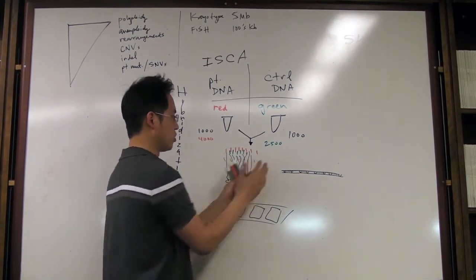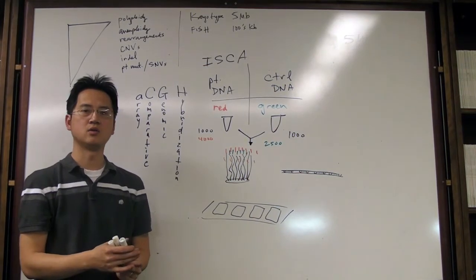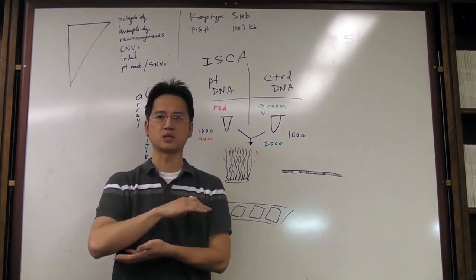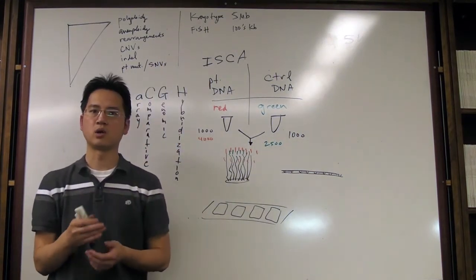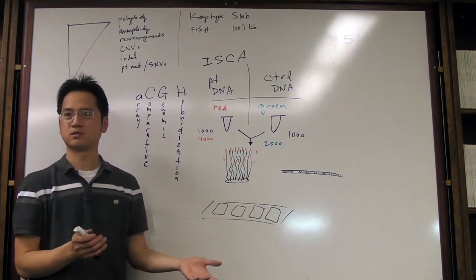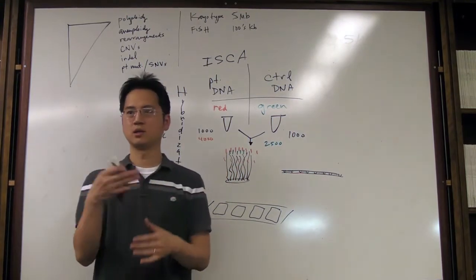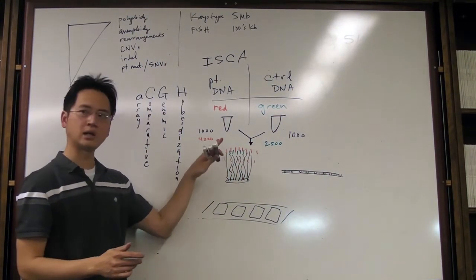So thereafter, you're going to remove things, wash the non-specific things out, and then you kind of cover, it's not really cover slipping, but you put it into this other protective, ozone protective barrier contraption, and then you're ready to scan it. So a lot of this sounds very similar to FISH, right? So all of the probing, the washing, et cetera, is essentially the same as FISH, but it's technically FISH in reverse.